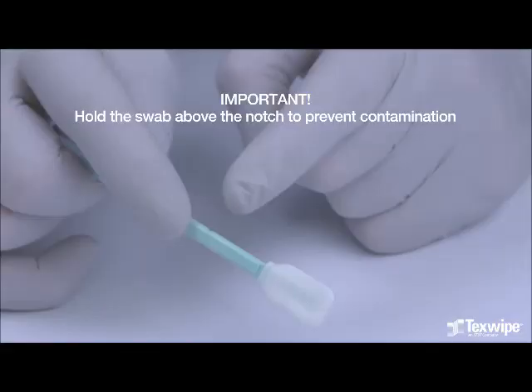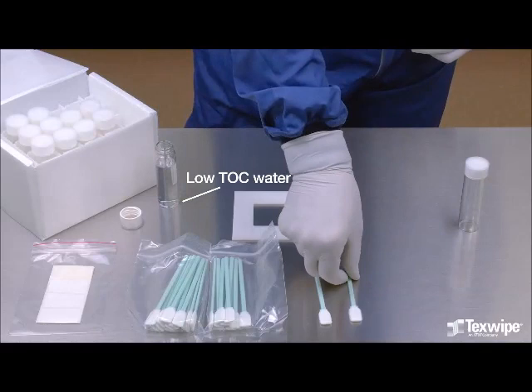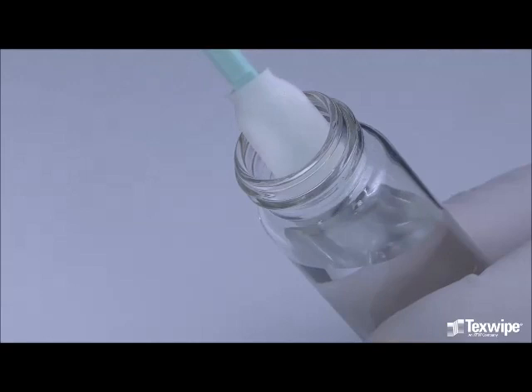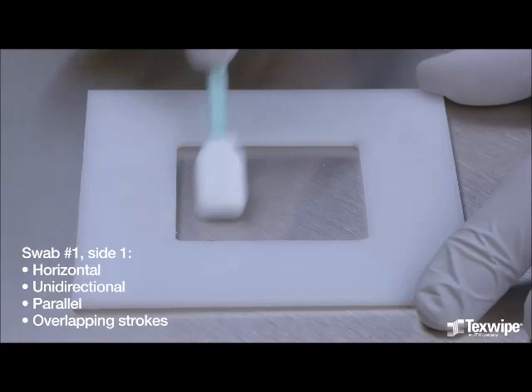Step 3: Proper sampling technique. Hold the swab above the notch to prevent contamination of the swab handle and head below the notch. Add low TOC water to the first vial. Dampen the first swab with water and remove the excess water. Begin sampling by swabbing the surface using horizontal, unidirectional, parallel overlapping strokes. This is the first side of the first swab.